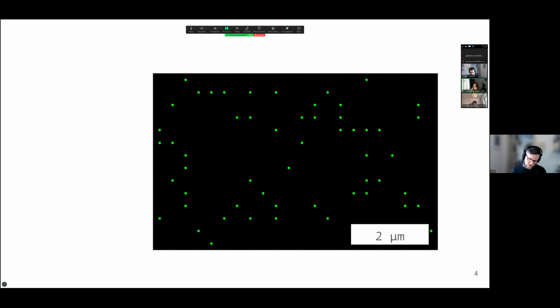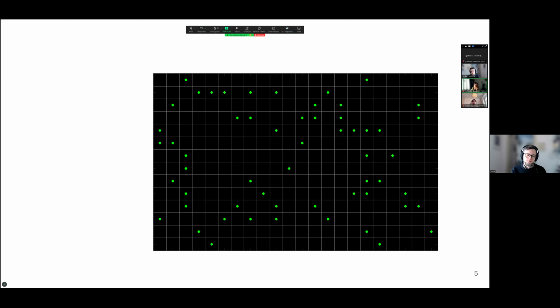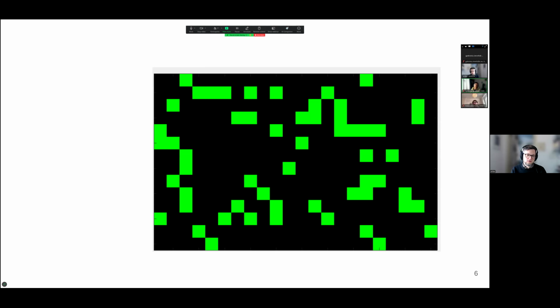But what happens when we put it under the microscope? Well, one thing is that the sensor has pixels of finite size, so even if there are small details, you would not see them. Instead of seeing the tiny spots, this is more what you would see.